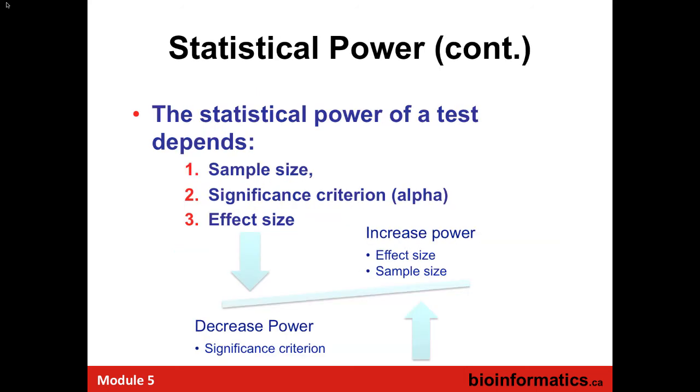you have to have some preliminary data. Now, to get a more powerful study, larger sample sizes are better. That's just a rule. That's obvious. There's a thing called an effect size, which is how significant are the markers or the chemicals or the genes or the proteins that you're looking for. How different are they between the control and the cases? And that's where you actually need some preliminary results. And this is the whole point about power calculation, is you need to have had at least a sample, a pilot study done, to be able to determine this.